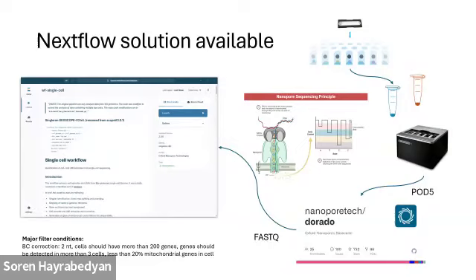Also, now the Singleron bioinformatician team produced a Nextflow pipeline. It means that users of long-read sequencing can use Epi2Me Labs. This is the Nextflow platform for long-read sequencing.